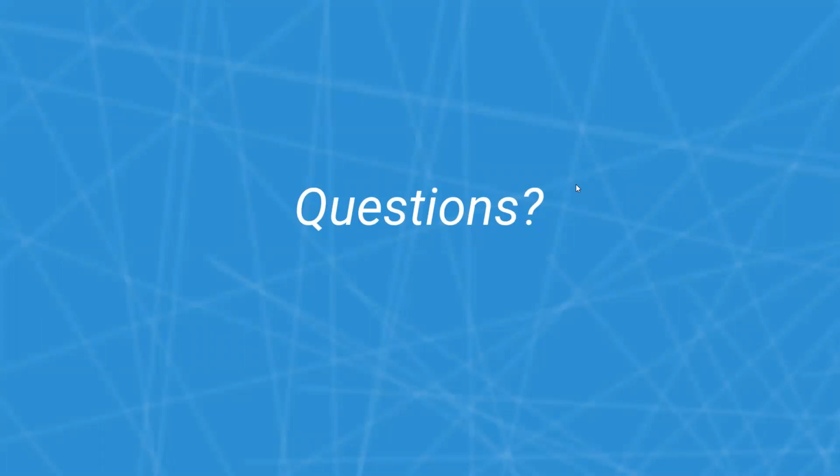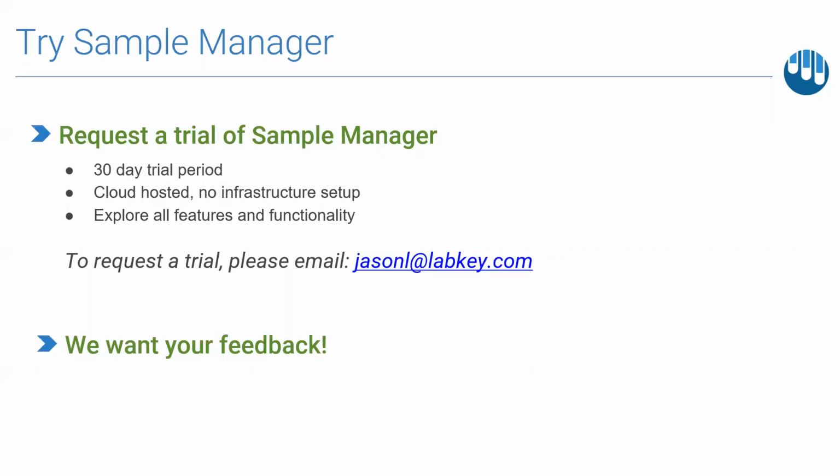So one of the questions here, which we can tackle, is: is an on-premise option going to be available, which is not mentioned today, only cloud? Actually, there is an on-premise option, but today we're talking about the cloud-hosted option only, the standalone LabKey Sample Manager. But if you're interested in an on-premise install, please reach out to us. I'll just put my email address back up there, and we'll have that conversation separately to this.